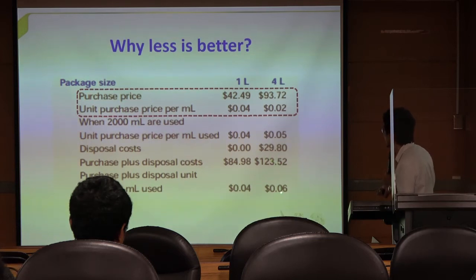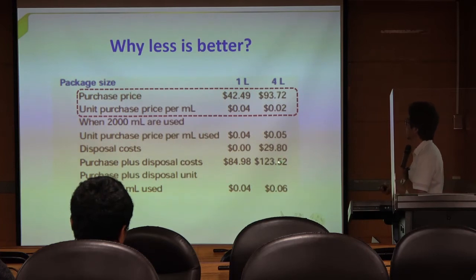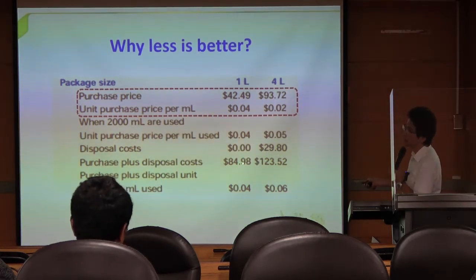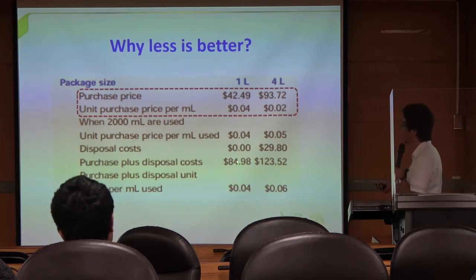Then you can see the expense for every liter. The purchase plus disposal cost for the 4 liters is much more expensive than for the 1 liter, because you do not use it all.